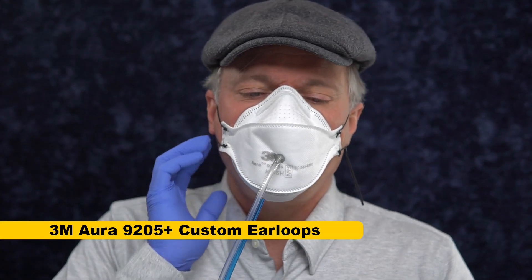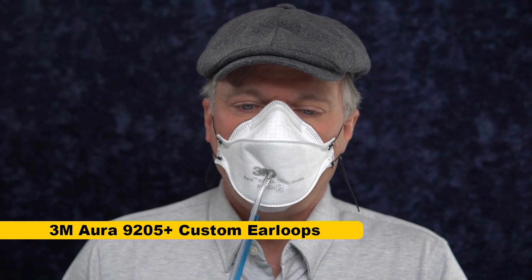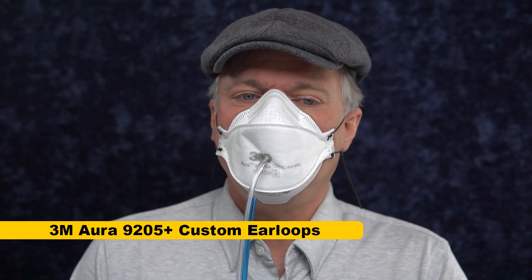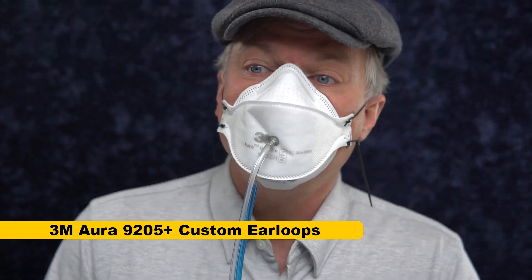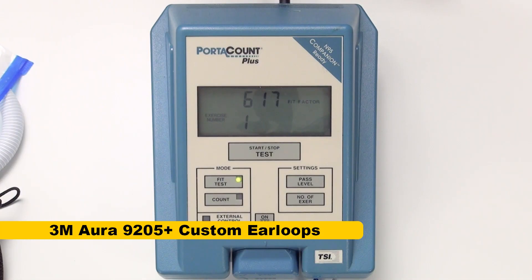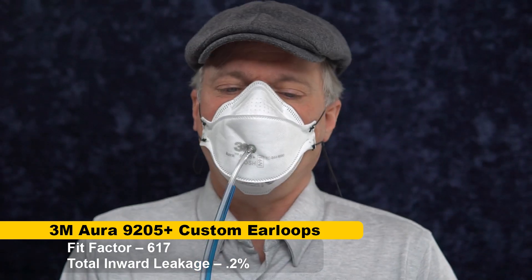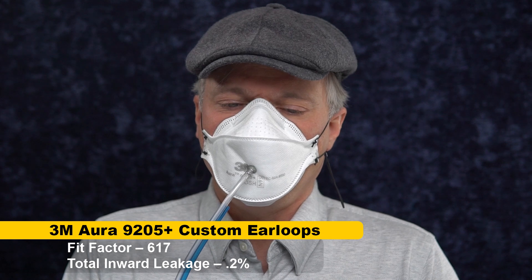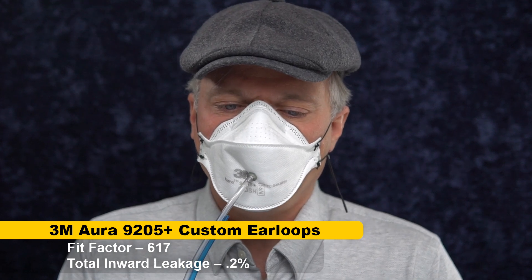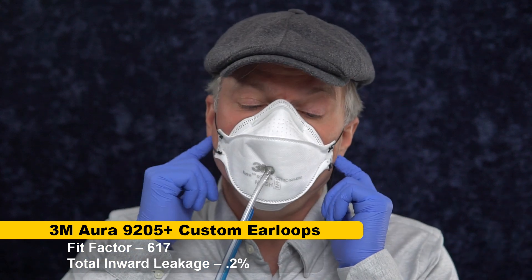I set these to a more comfortable level. Doesn't feel quite as well-sealed as the headbands, but let's give this a try. 617 — still an outstanding number. That's more in line; I usually get above 300 with Auras. So I'm still getting headband-like results with the ear loops.